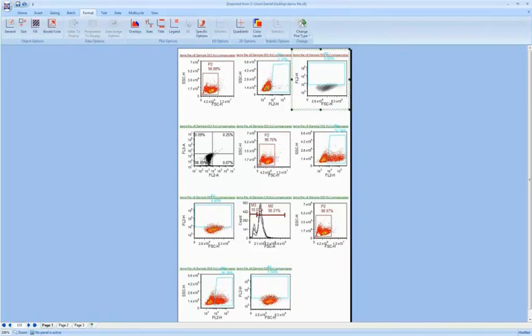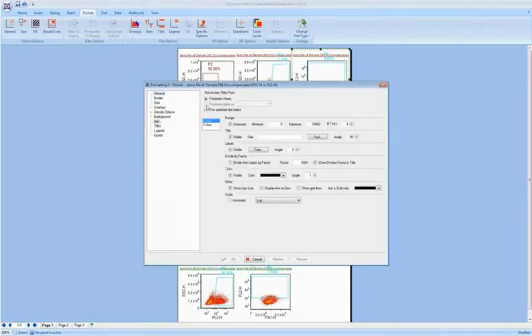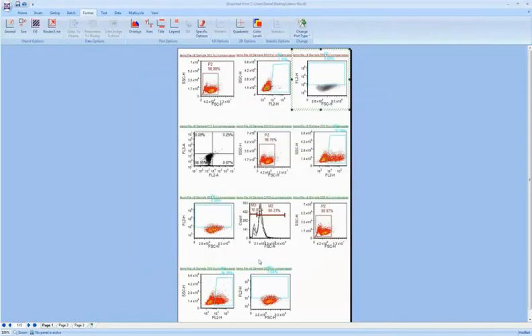But if you always know that your parameter 3 is a certain stain and your parameter 4 is a certain marker, you can do that using the parameter label sets. And we can send you a link after that for documentation on using parameter label sets in FCS Express. What it would look like in the plot is simply right-click, go to Axis, and choose a parameter label set. Now you can see that this is grayed out because I don't have any label sets defined. But if you define a label set, then you will be able to do that.